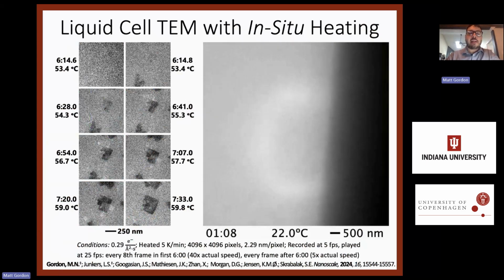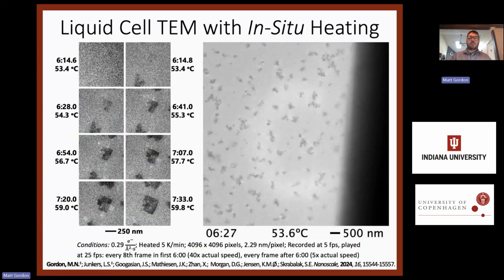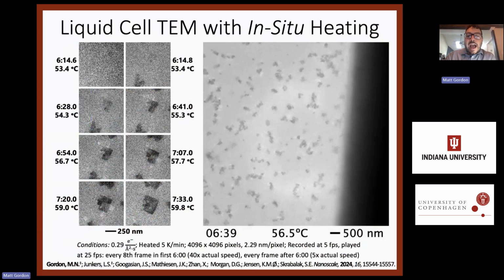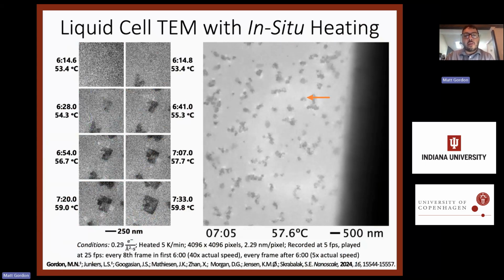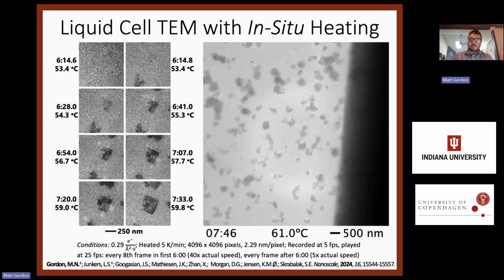It's going to go quite fast up until about the 6-minute mark as the temperature heats up. After 6 minutes, we'll slow it down slightly, and you'll be able to see this kind of one moment where you just have burst nucleation right there. And so that burst nucleation happens. We then see particles can move around slightly. You'll see some of them become thicker and thus darker. And often we get more square and rectangular plates that form, and the square and rectangular morphology is due to the crystal structure, which has a preference to form these plates.